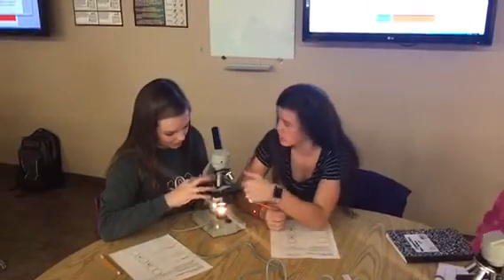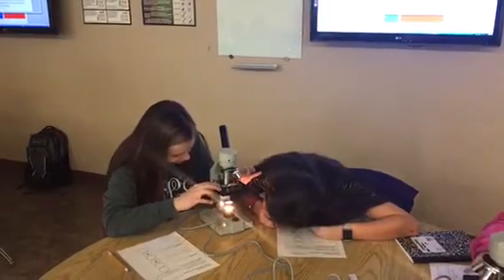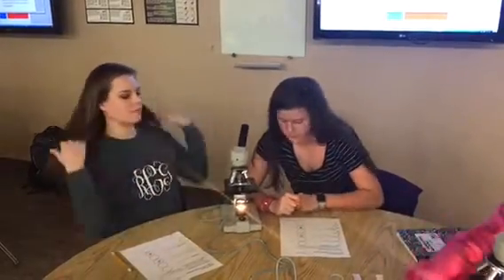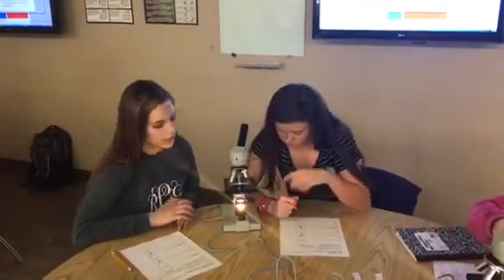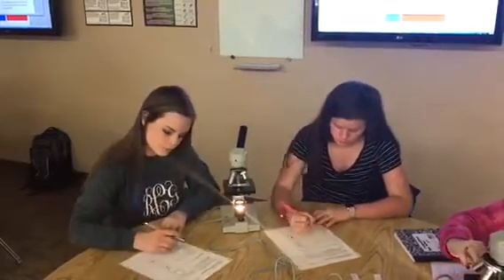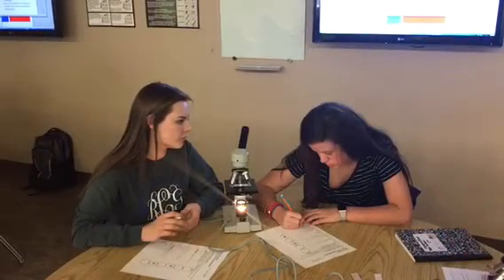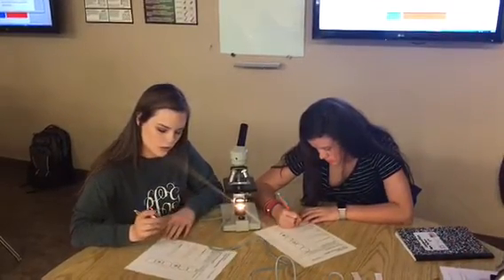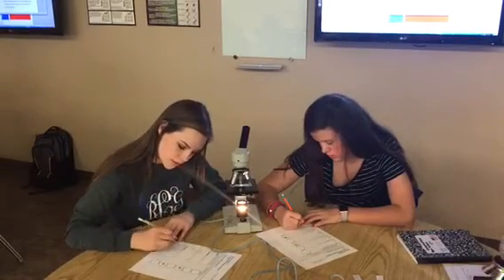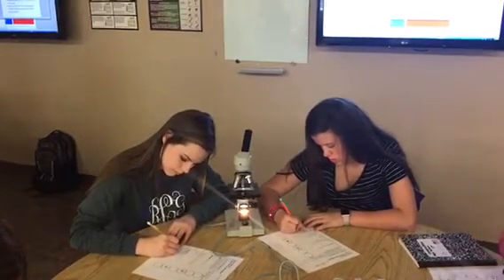So that just lets water? Yep. It's water. Wait, salt. Which one is this? Salt. Okay. So, the one with little cubes. That's going to use your fine adjustment. It's just going to make the image clearer.